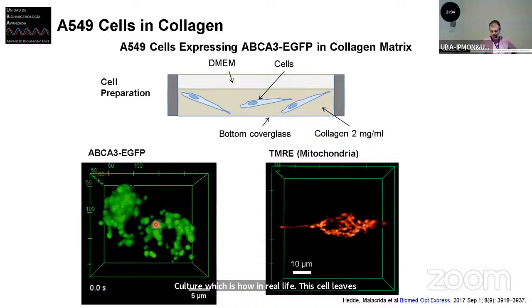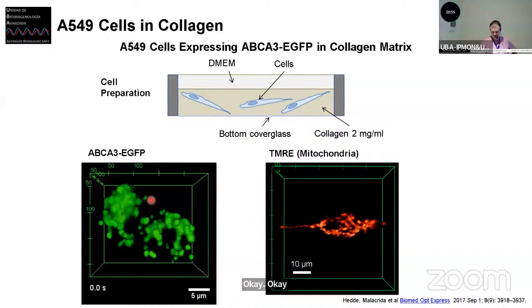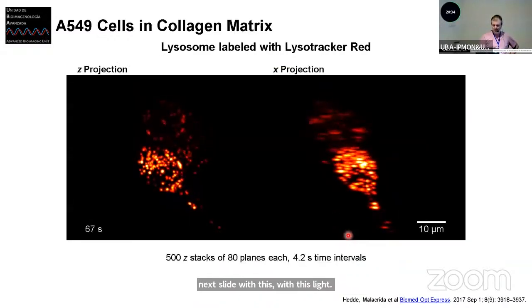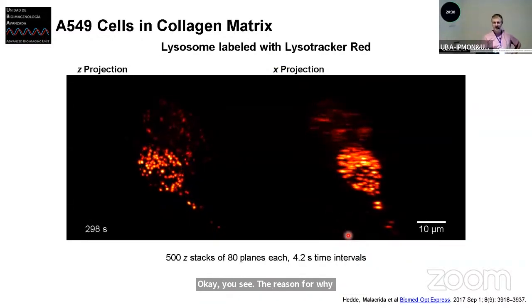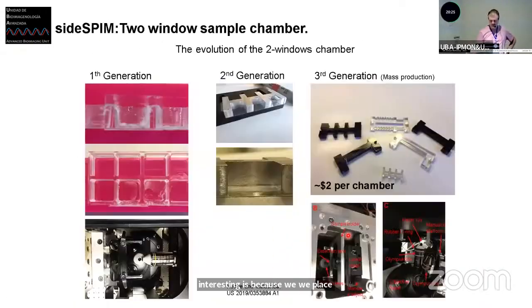And these are two examples. I don't know if the video is working now. Not here. Okay, this is supposed to be two movies, in which these are lamellar bodies inside a cell, moving here and there, and this was mitochondria, and we were able to image in 3D very, very fast, as I will show in the next slide with this light sheet. The reason this is very interesting is because we place this, let me go back so I can show you in the microscope.